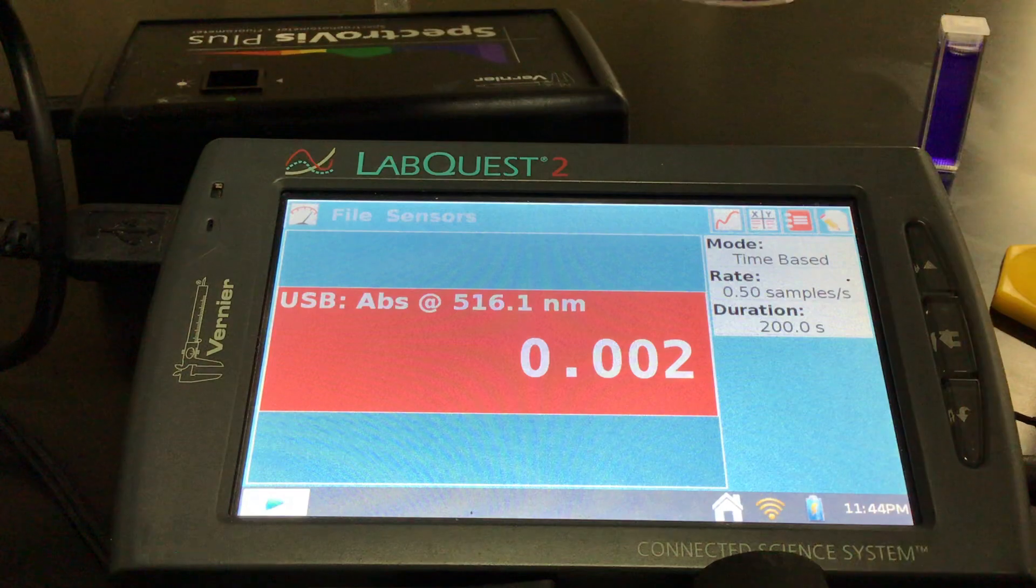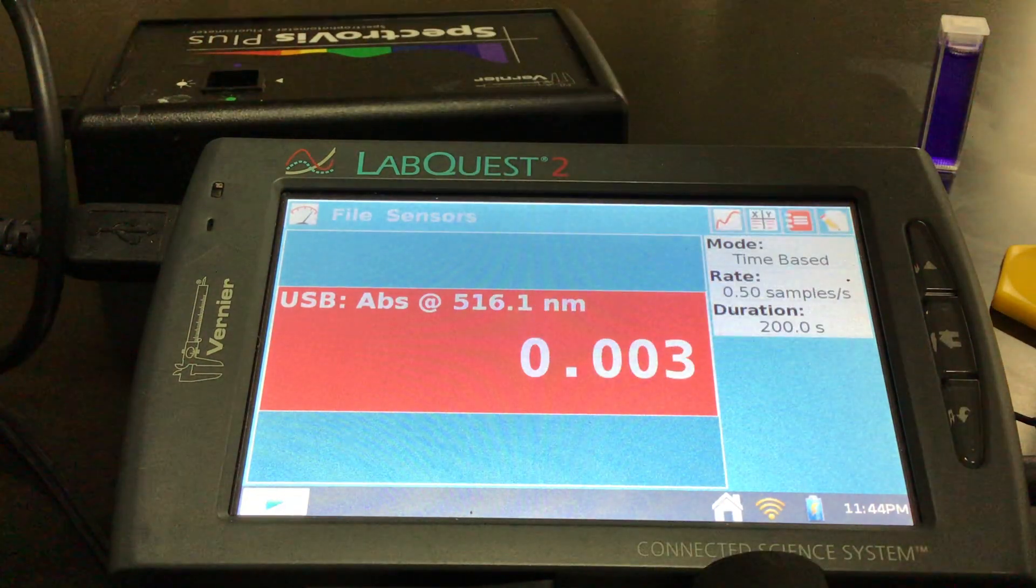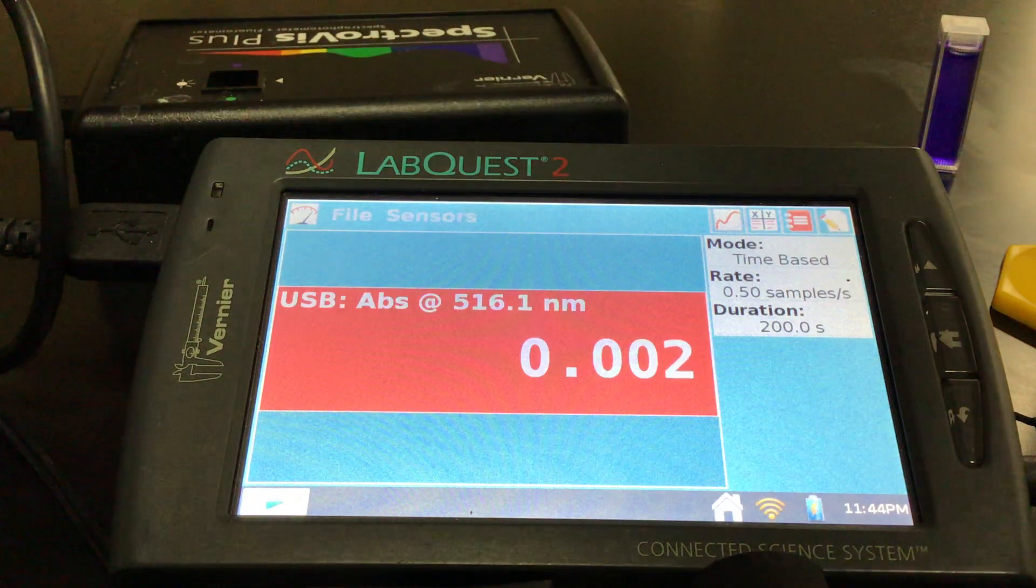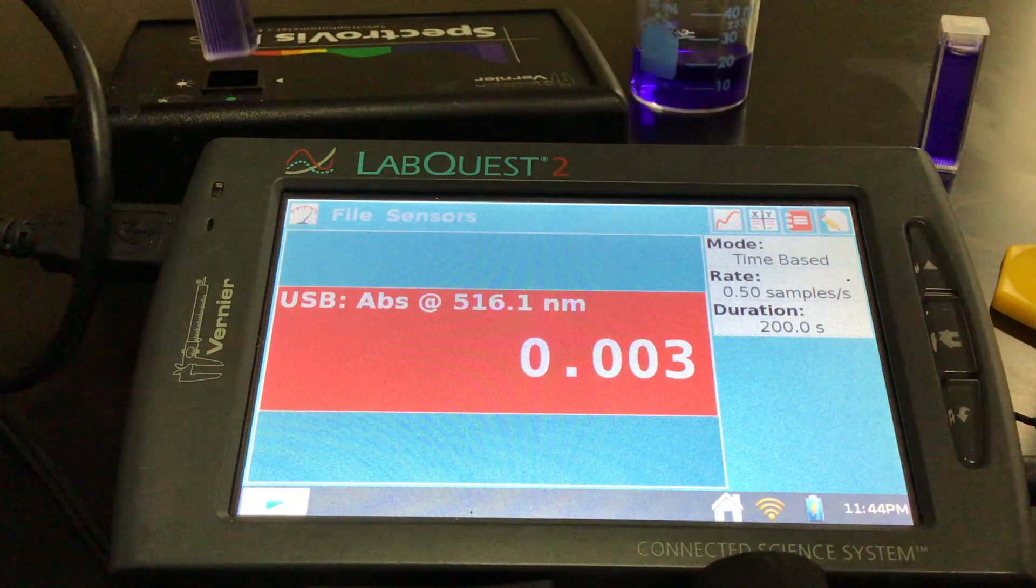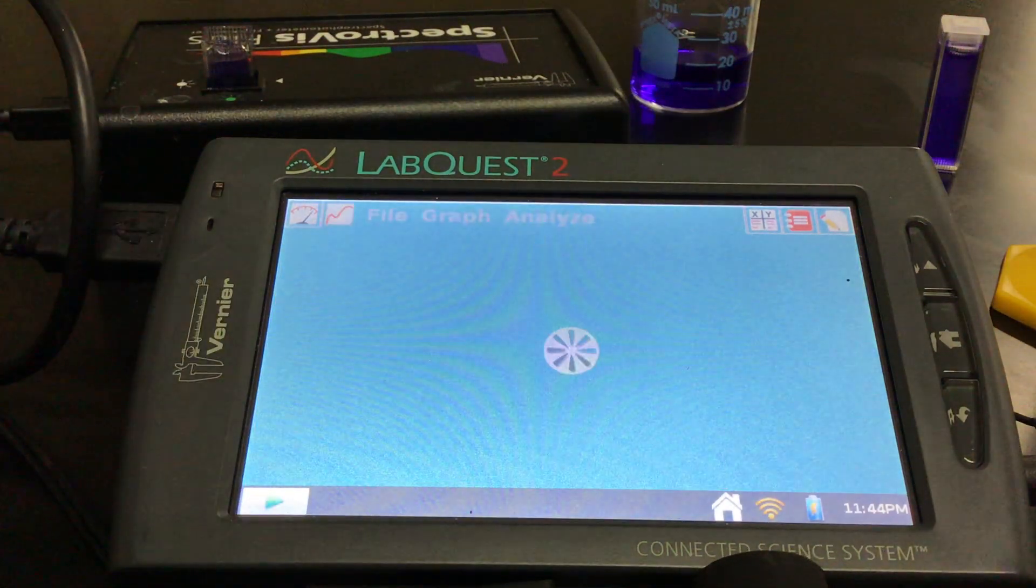We're going to pour this together, give it a little swirl to mix, pour this into a cuvette, put this into our spectro viz and start collecting data.